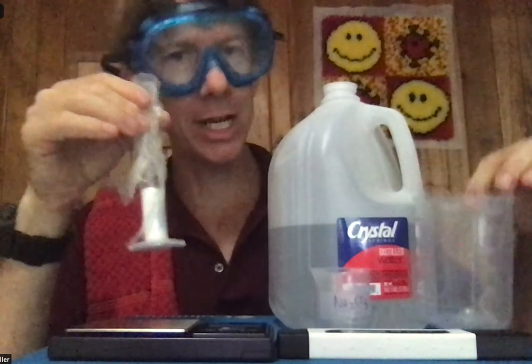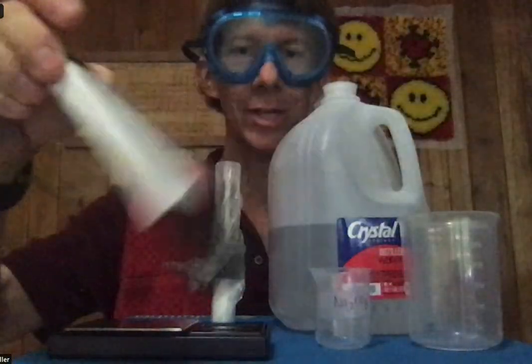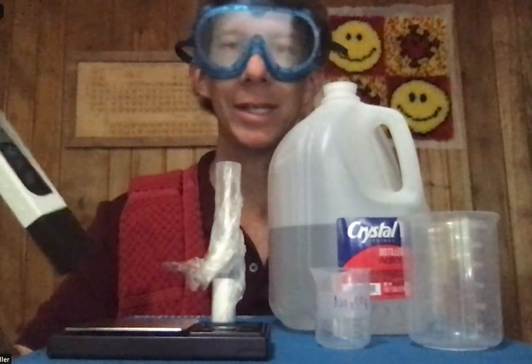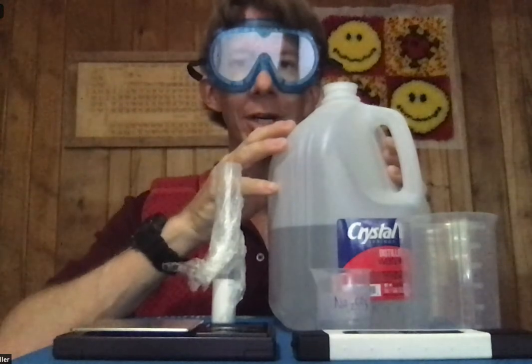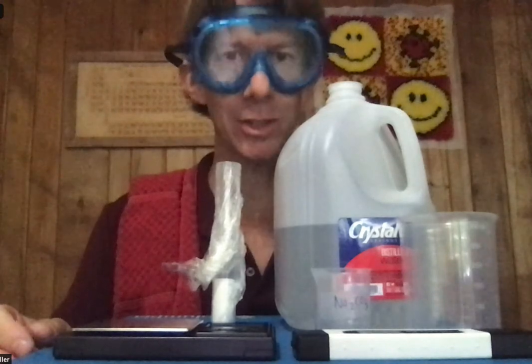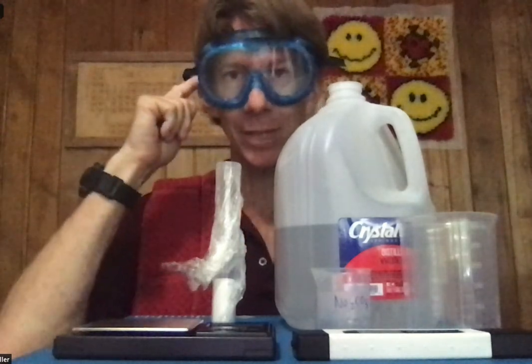I've got my clean dry 250 milliliter beaker, my scale to take the mass of things, my temperature tester currently turned off — also used as a water tester in temperature mode — and my distilled water. We'll be equilibrating approximately 400 milliliters of it, which should be enough for the experiment but not too much.